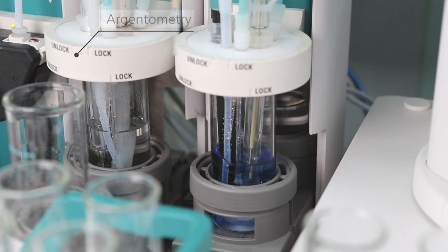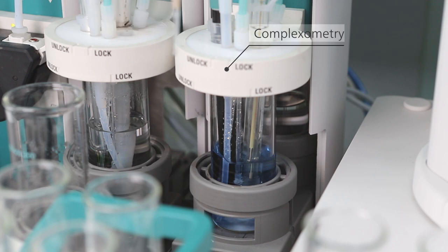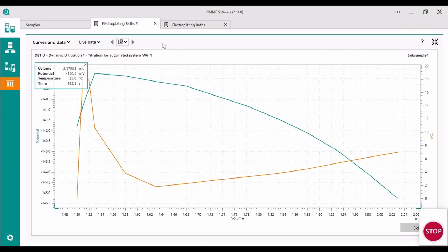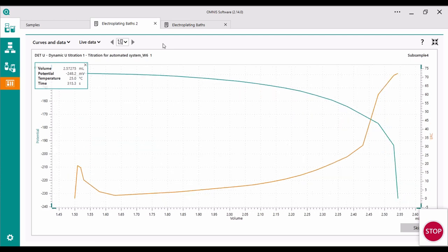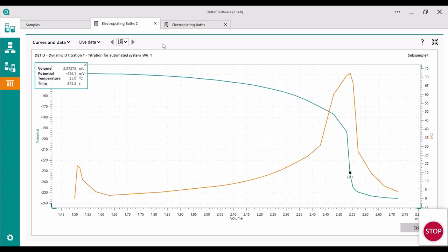The fourth titration is a complexometric nickel determination with EDTA as the titrant. Auxiliary solutions are ammonia buffer and equimolar amounts of copper sulphate and EDTA as the indicator. The used sensor is a copper iron selective electrode.